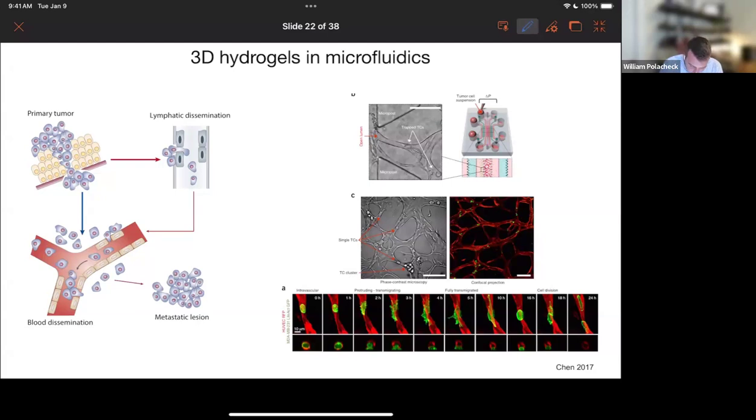Here you're looking at a vascular network between two posts, like this entrance area. This is a very fortuitous image. If you try to do this yourself, you'll find a lot of cells like to line these pillars. And when you get beautiful vascular structures like this, it's most likely that one surface of these cells is in contact with the bottom glass.